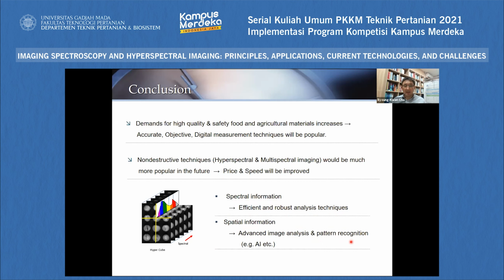So deep learning technology. We are also investigating deep learning technologies for hyperspectral image analysis. I think the combination of deep learning and hyperspectral imaging is quite promising. It's still in the research stage, but it's quite promising, I think.